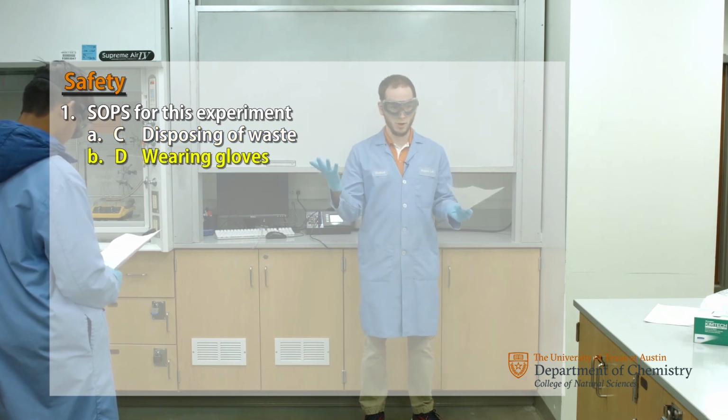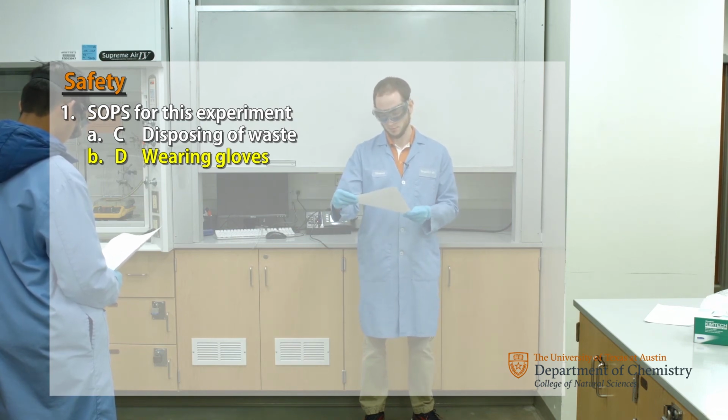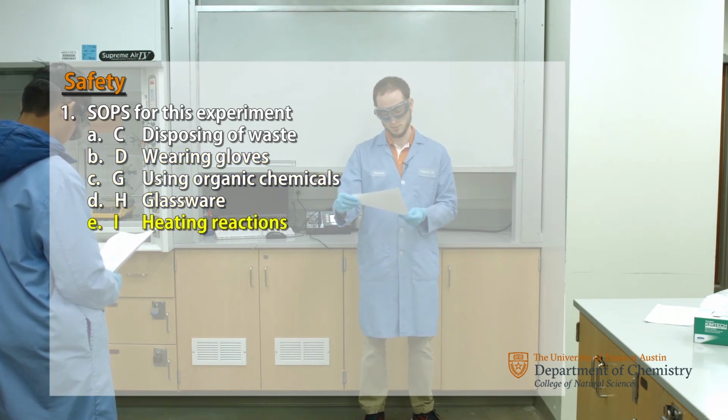If you ever get anything on your gloves, any solvents, any chemicals on the gloves, go ahead and take them off, throw them in the trash, get yourself a fresh new set. Using organic chemicals, glassware, heating reactions, standard operating procedure must be followed for all of those elements.